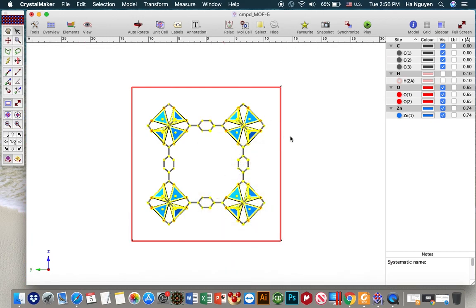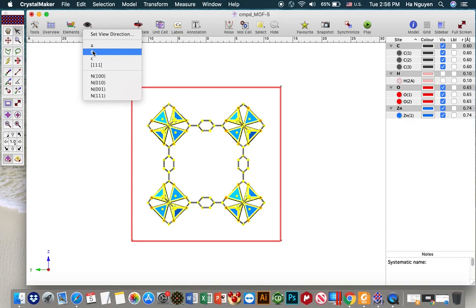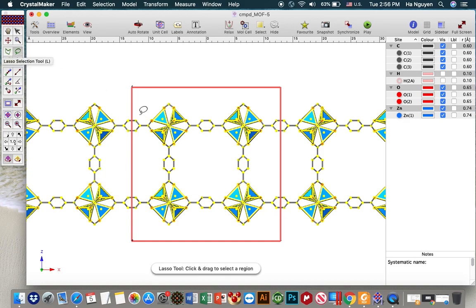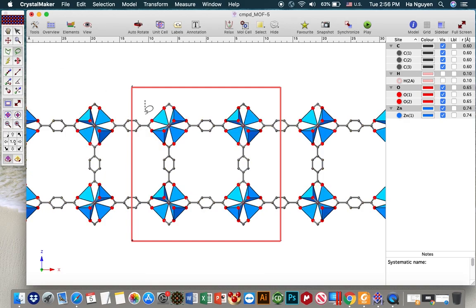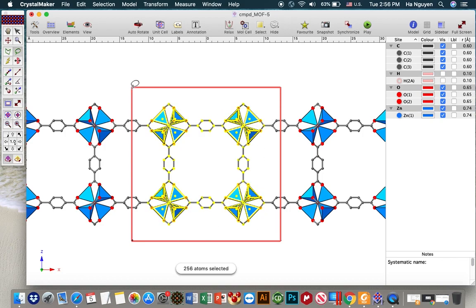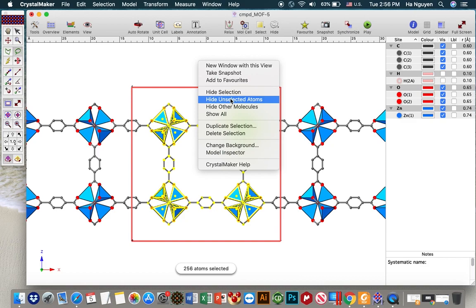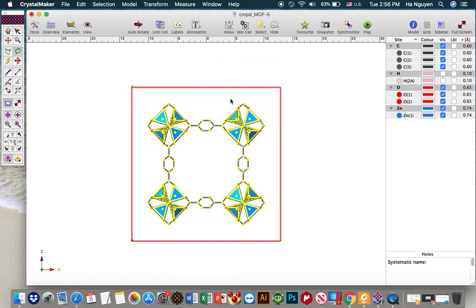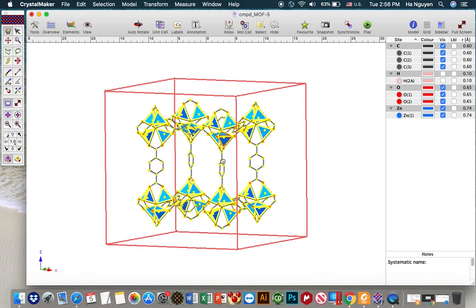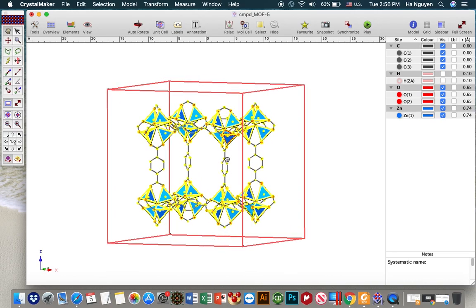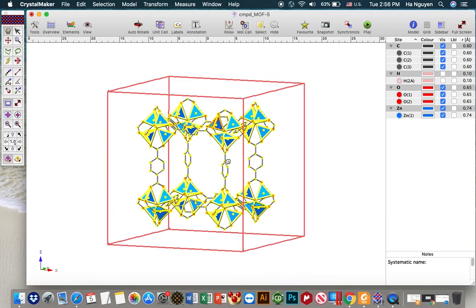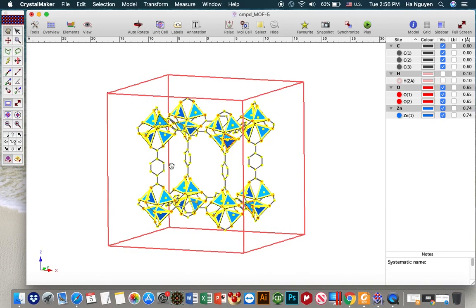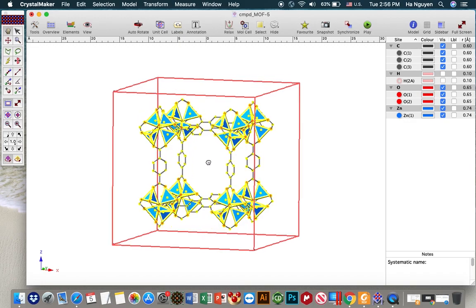Click to that and then you move the direction to B and then you do the same thing. Another tool for selection you can use is the lasso tool. For lasso tool you can do something like this very quickly, then you hide everything except for the selected one. And now you have only one cage of MOF representing a smaller pore.